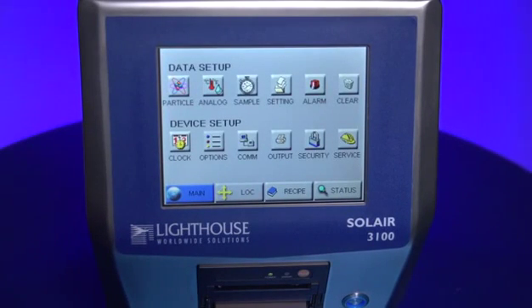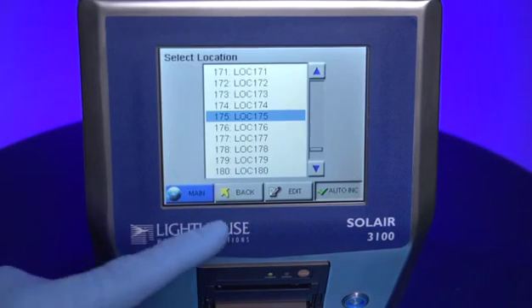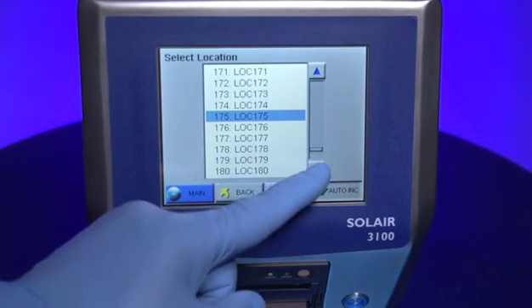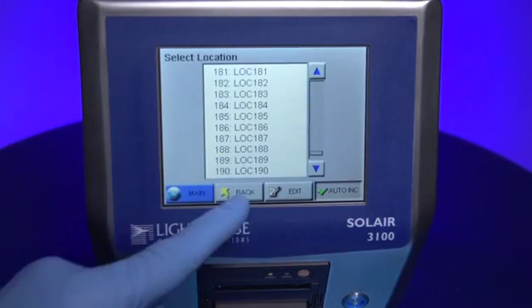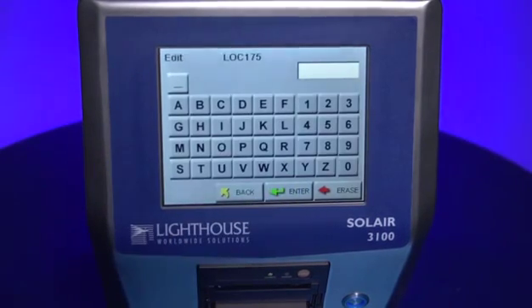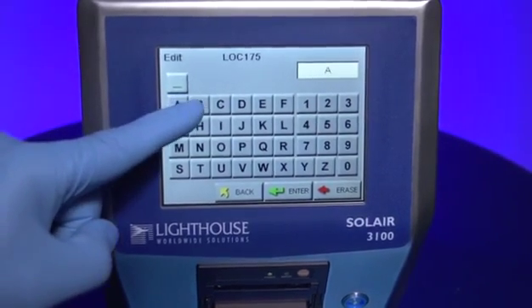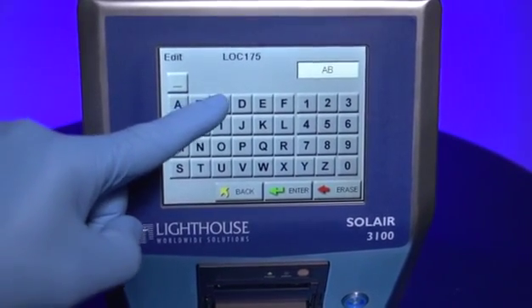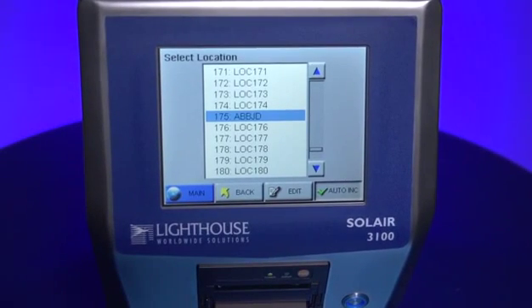Then select the Location button at the bottom of the display. By moving the selection bar through the location with the arrow keys, you can edit the location names by pressing the Edit key. From here you can enter up to 8 characters for your new location label. When you are finished, press the Enter button to return back to the location selection display, where you can update the next location label.